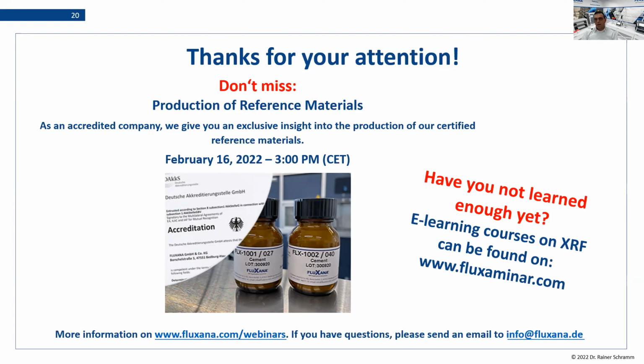If you don't add any chemicals and it's just a straightforward preparation, let me say 1 part sample, 8 parts glass former, like lithium tetraborate, then it will also work with a standardless approach. But of course, a dedicated application is the same or better quality. So let's see what else comes up.